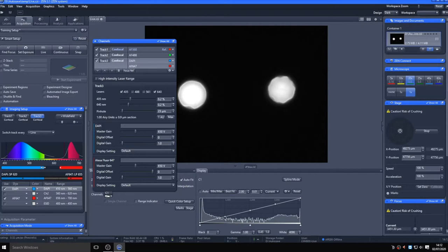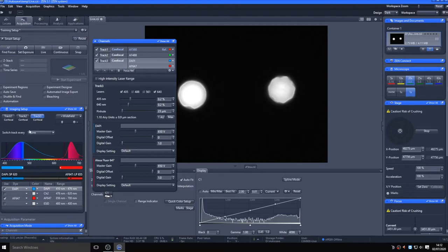This may not be completely ideal for your specific fluorophores. As you see, if I reduce the collected wavelengths on the DAPI channel, an effect is also seen as an increased wavelength range on detector two, as seen in track one.